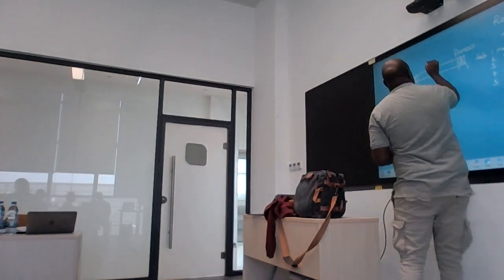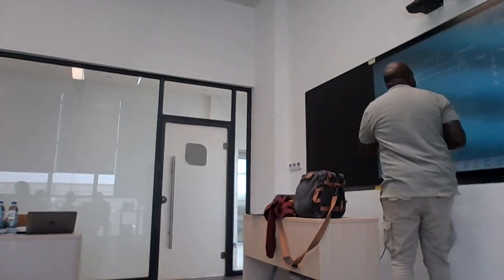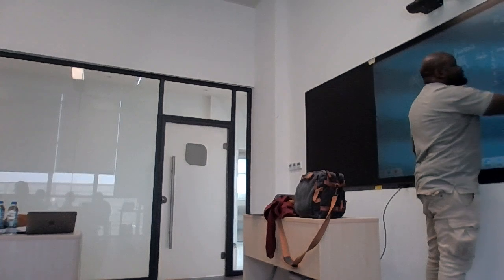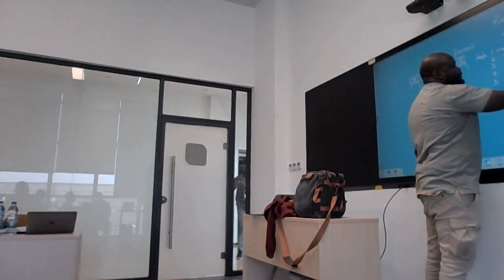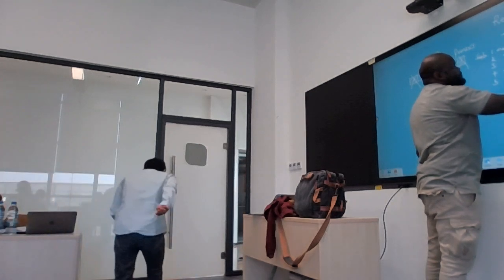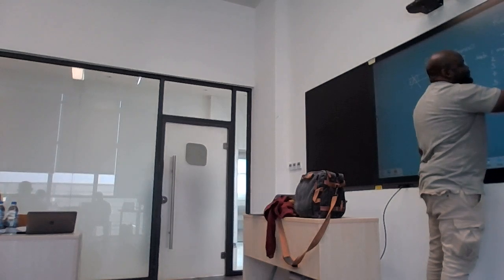Now what the workflow does is, every time you remove something, it recalculates the quality, okay? So now we've removed our primers. We ask Q equal what? Then you get that quality. Maybe after primer trimming, it could go lower, but who knows? Let's play around with this. So we could say this goes to 35.